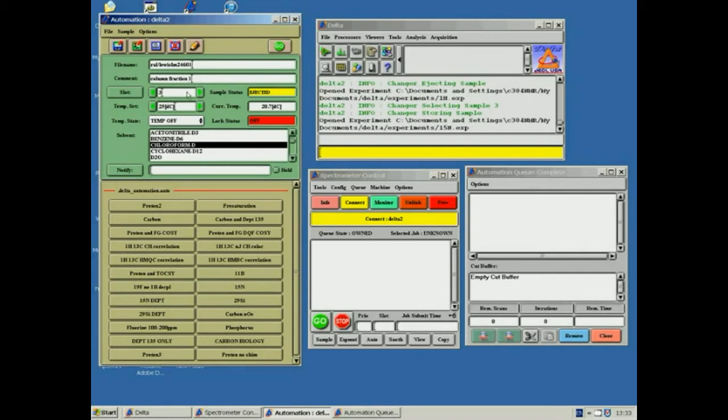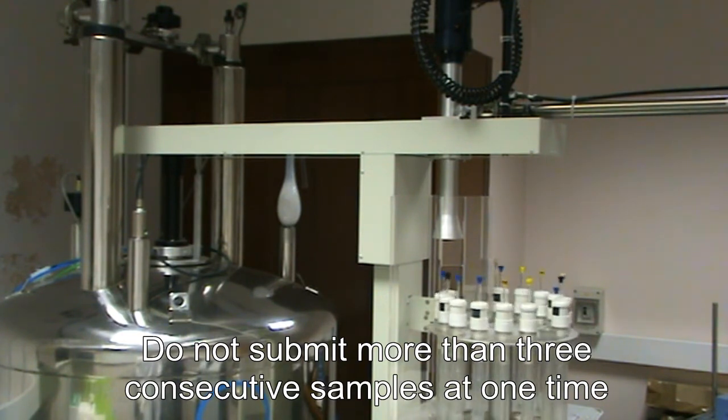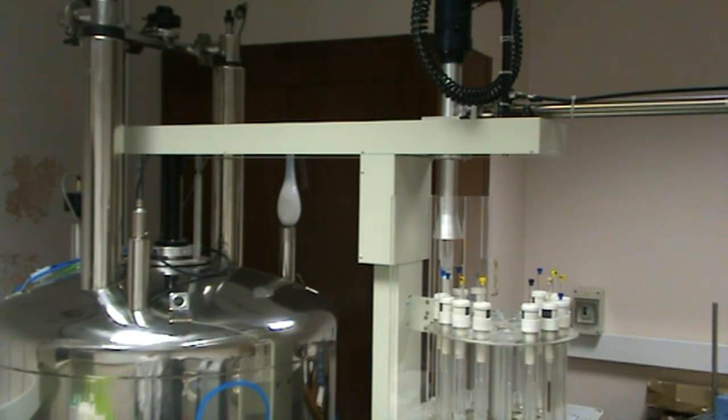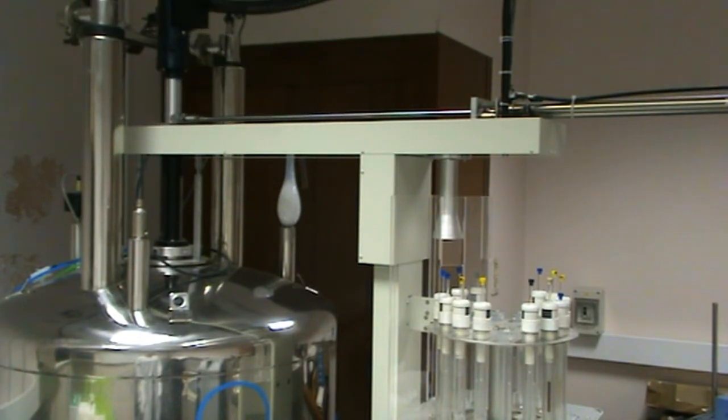Once this is done, the slot number is entered and then the solvent chosen — in this case, deuterated chloroform. The temperature control should be off. Next, choose the type of experiment you wish to use; I am using Proton Analysis. Click Continue.